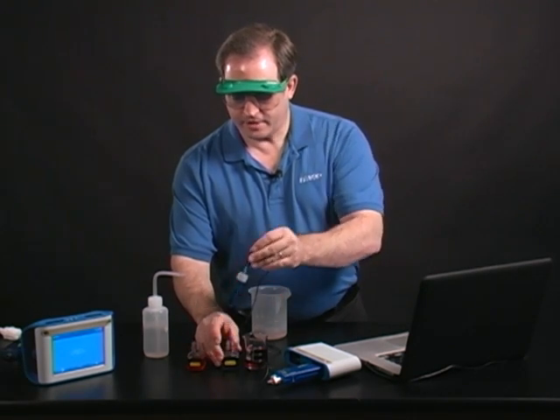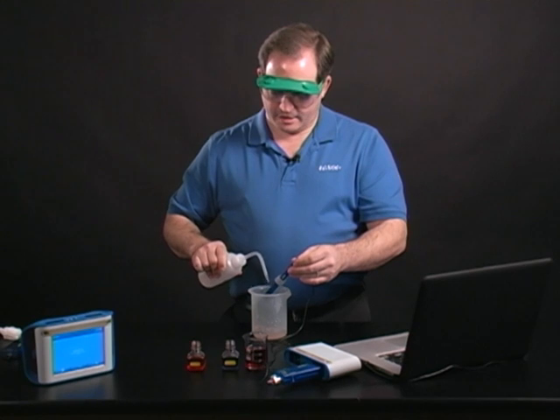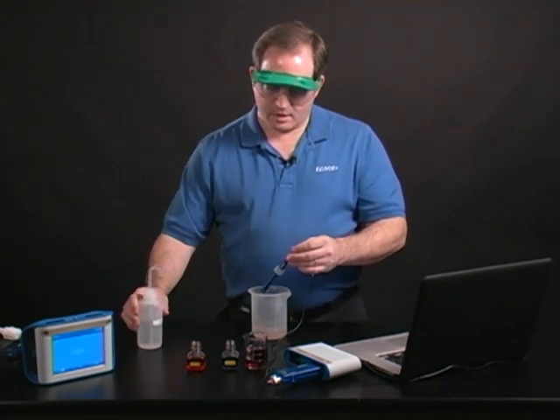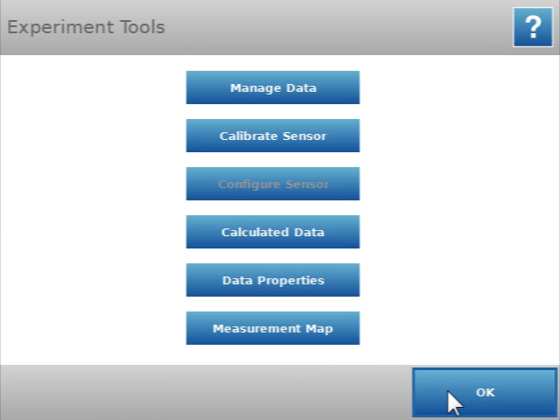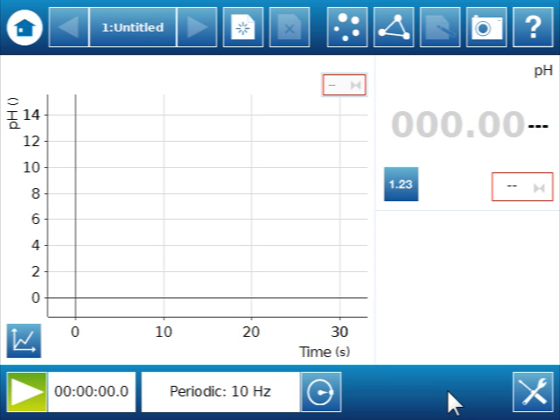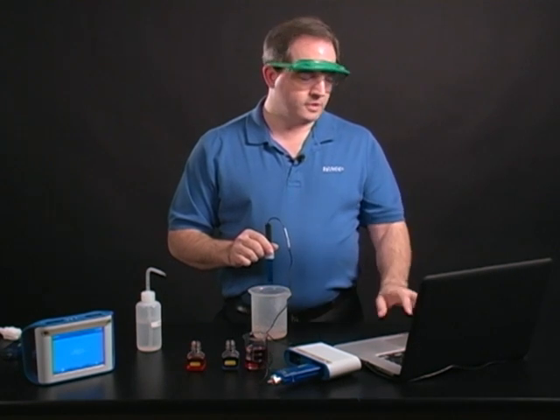Now that I've finished the calibration, I can rinse that off. Once I say OK, it will save that calibration with the file. Say OK again, and now I'm ready to measure. Let's go ahead and do that. I'll start collecting data.